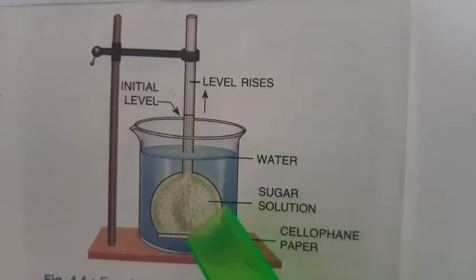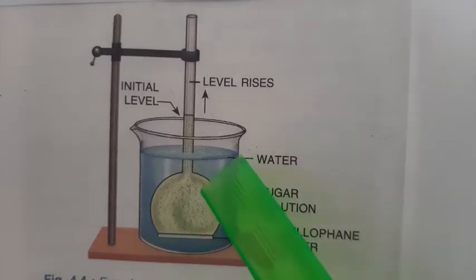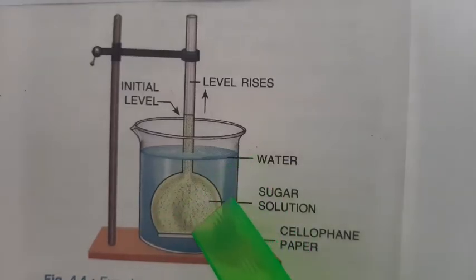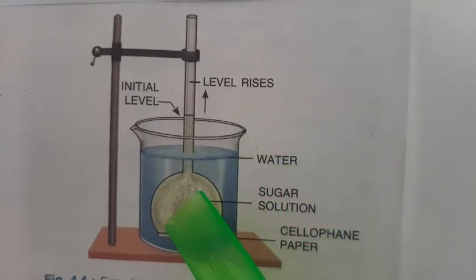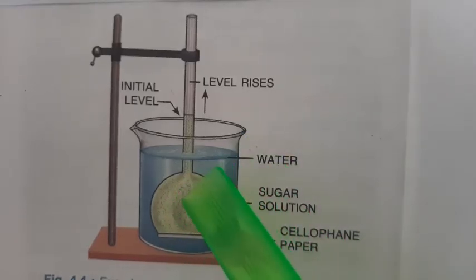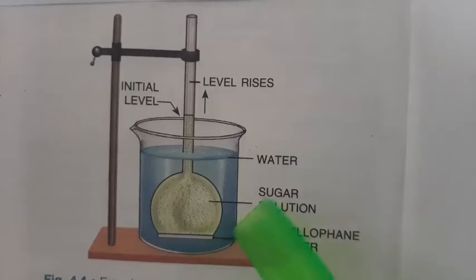At the mouth of the thistle funnel there was cellophane paper, and this cellophane paper has acted like a selectively permeable membrane, or a semi-permeable membrane. It has allowed water to get inside from outside, but no sugar molecules have come out from the thistle funnel.